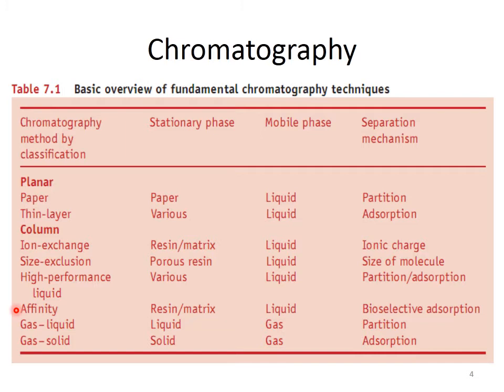Similarly, several different types of enzymes could be purified by using a stationary phase which contains the substrate of that enzyme. So the enzyme is going to bind to the substrate which is present on the stationary phase, and other proteins will not be able to bind. In this manner, we make use of the specific binding affinity of a particular molecule which is present on the stationary phase to capture a given molecule from the mixture.